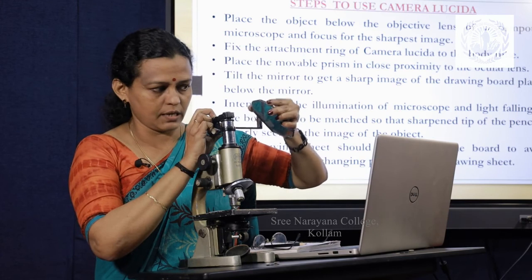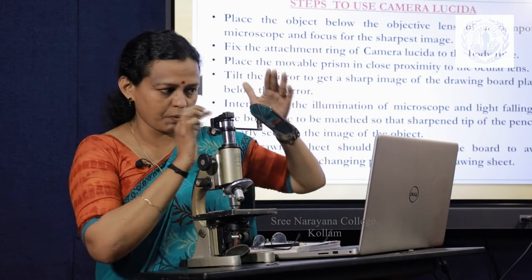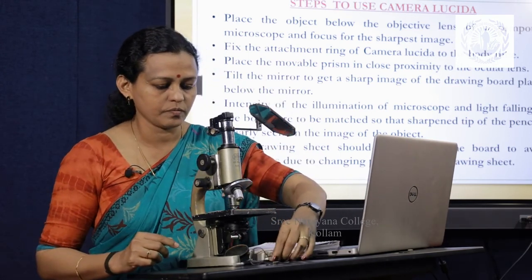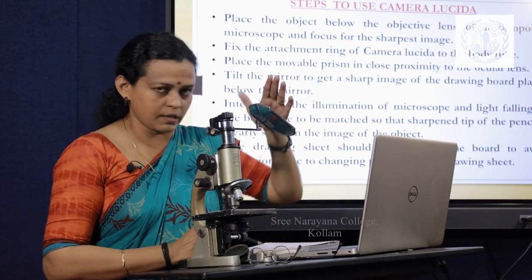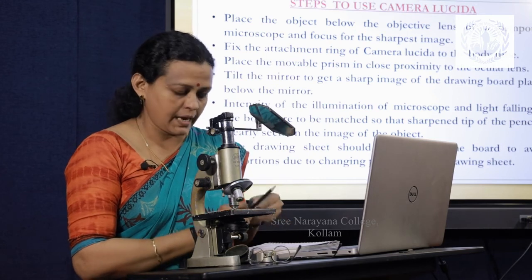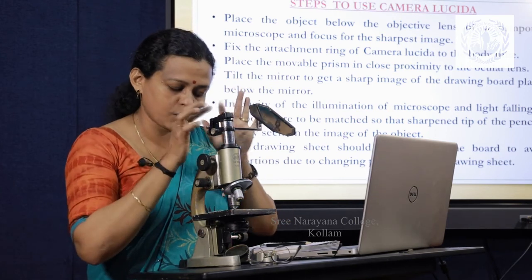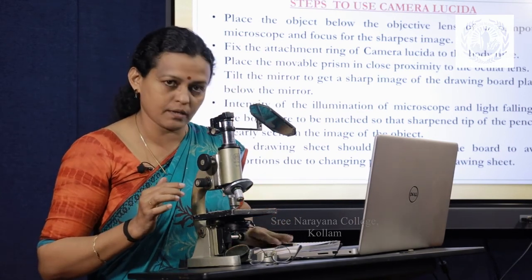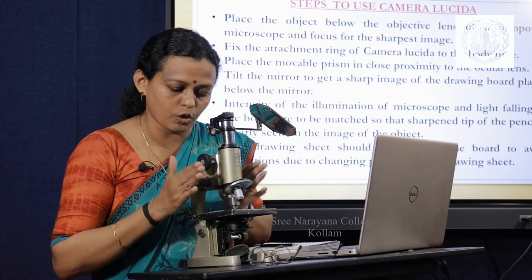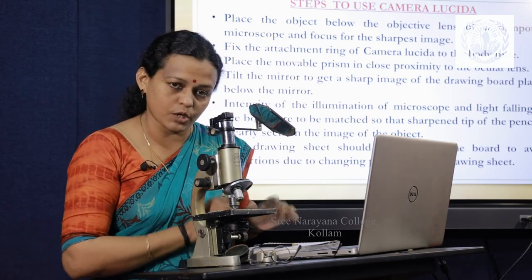You can see that it swings in different directions. Here it is at 40, it can be placed at 45 degrees. So now you see the principle. Just below the mirror I have kept the paper with a sharpened lead pencil. Now when you view through the microscope, you can actually see this paper and the lead pencil, and the image. It seems that the image or the object is superimposed over the paper, and you can actually draw here.